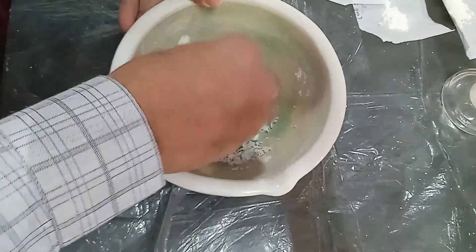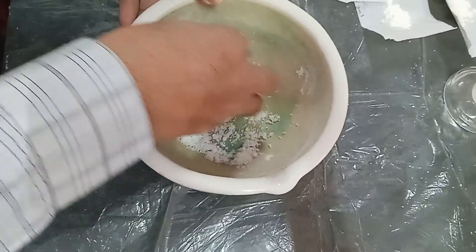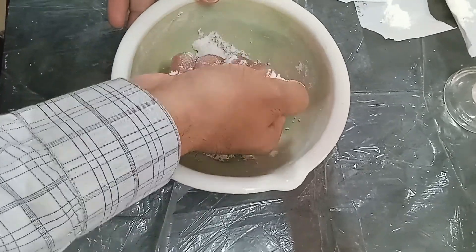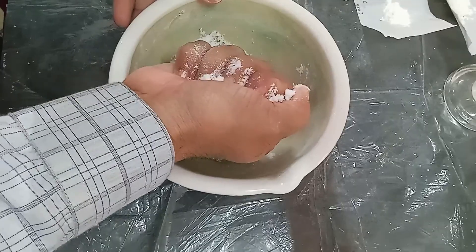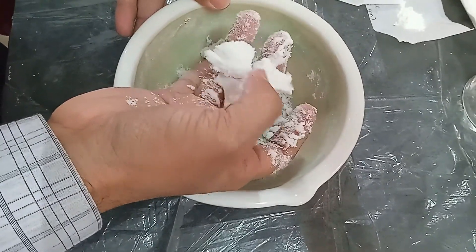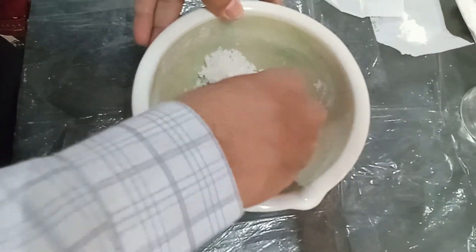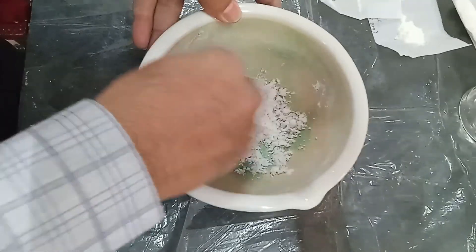So what is the end point of the granulation? You take the granules in a fist, compress and apply pressure in the middle. If it breaks in two parts, then it means that the granulation has been completed. Our granulation process has now been completed.